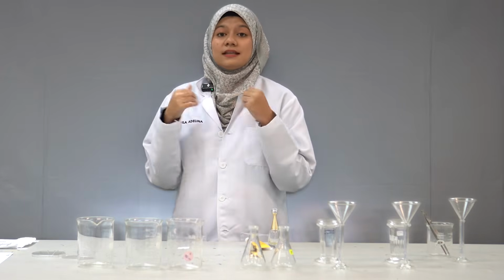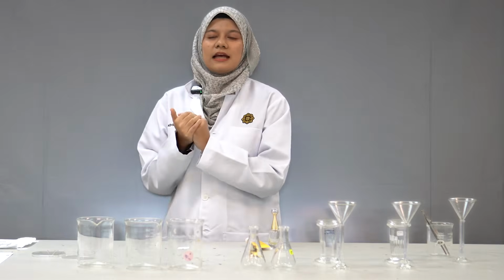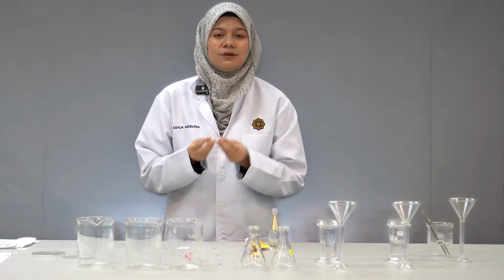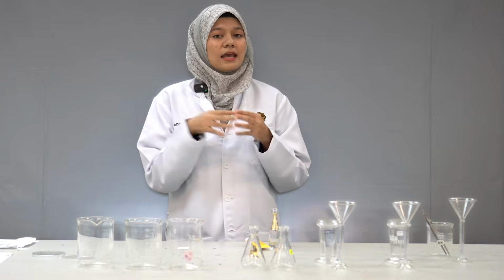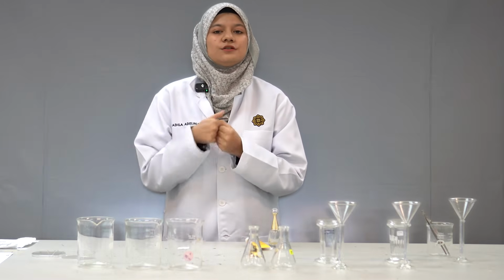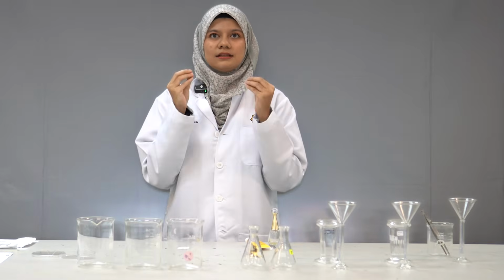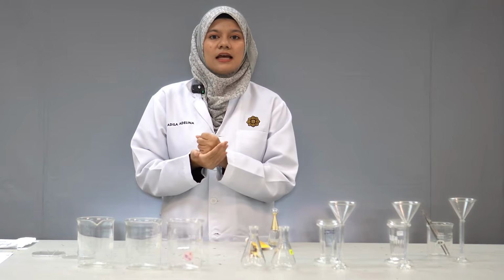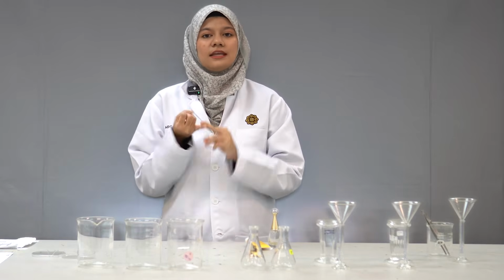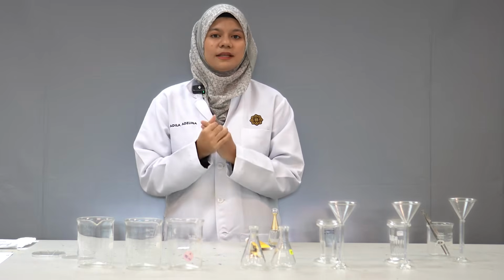So in the cosmetic industry, we use TLC for quality control by verifying whether the ingredients we use are suitable for the product and free from contaminants. Besides that, it is also used for stability testing to check if the ingredients degrade over time due to heat, air, or light. Besides that, TLC plays a role in environmental testing.